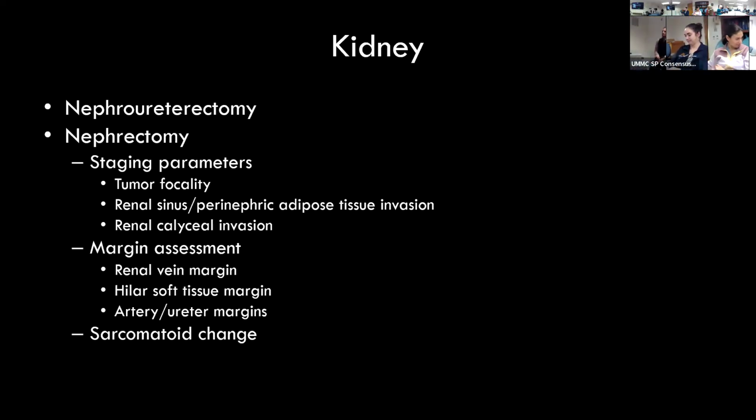Yeah, so far, was that useful? Because I don't know if all these nuances are being conveyed, because sometimes it's hard to know what to focus on, right? People just tell you, okay, this is how you gross the specimen, but you don't know what the most critical aspect of what you're doing is, so that's what I wanted to bring up here.